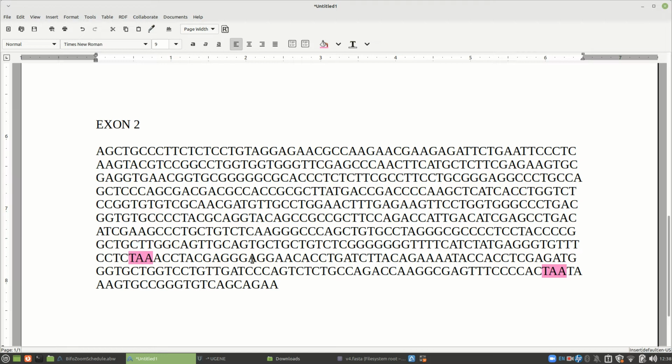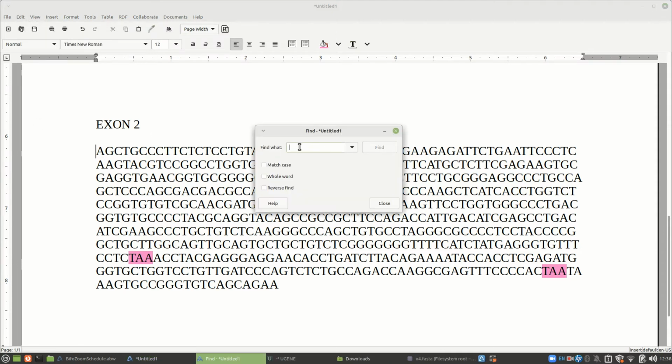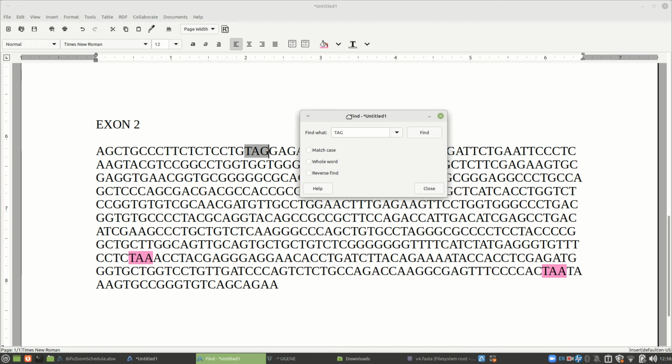We also have TAG. So, okay, let's click here. Let's go edit. Let's go find. And let's go TAG. Nah, that's not one. That's too far up there. I don't believe that would be a stop codon. We've got others. I'm going to go on. I'm going to assume that it's going to be later. There is nothing keeping that one from potentially being the stop codon, but I don't believe it.